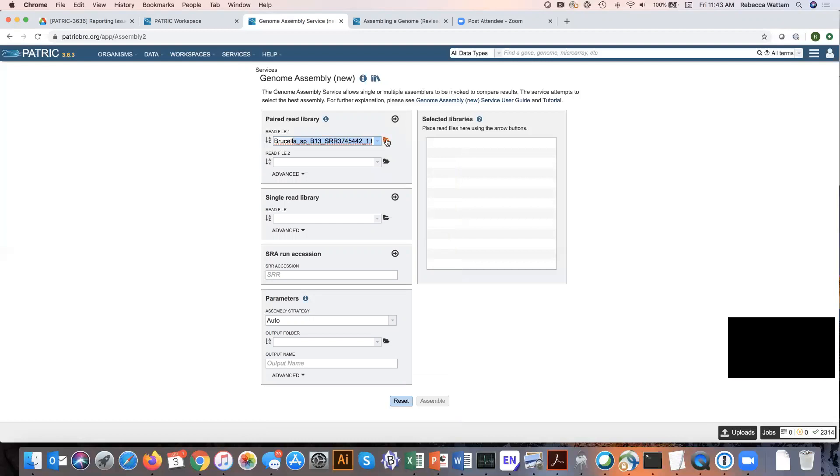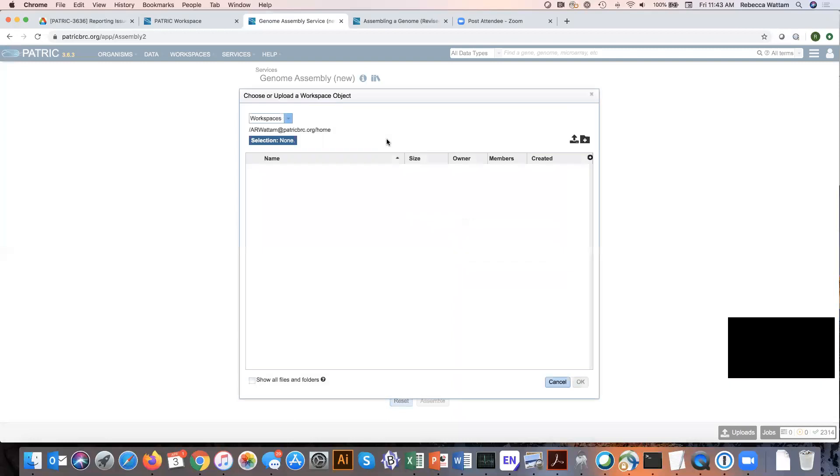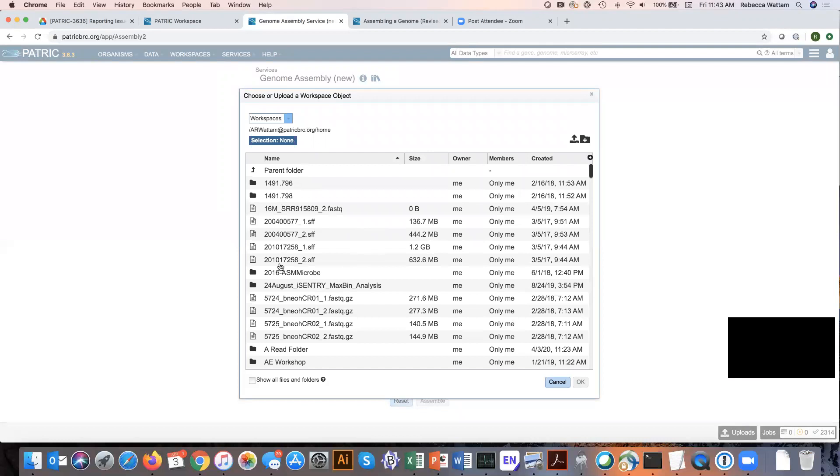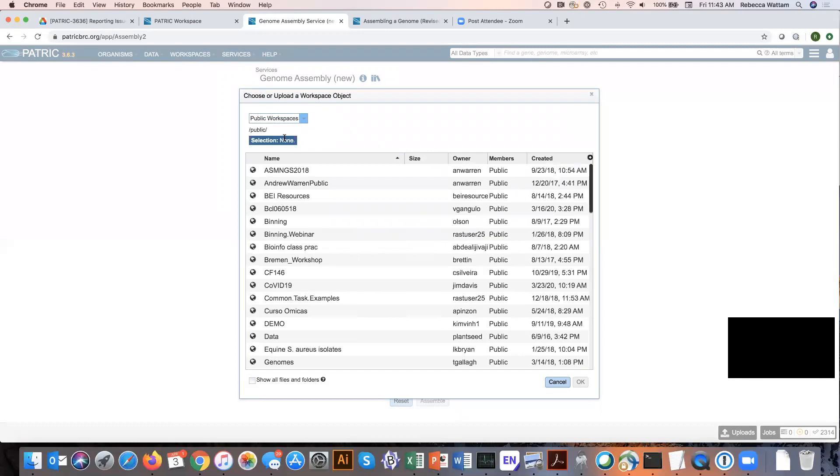Another way is to go directly to the workspace and find data that you loaded previously. So we're actually going to use this because I've uploaded some data for you. Click on this down arrow here and then click on public workspaces.